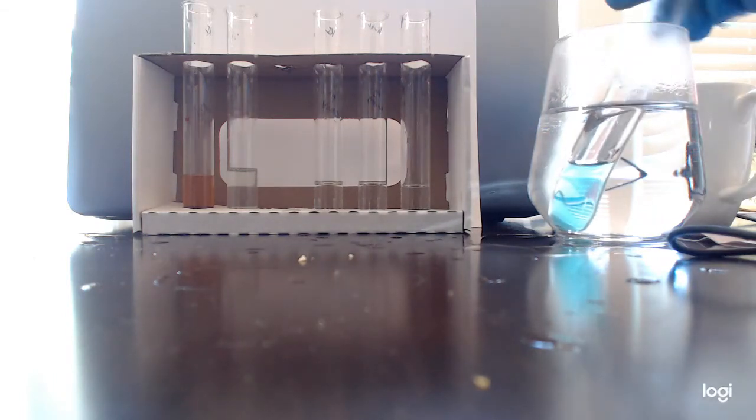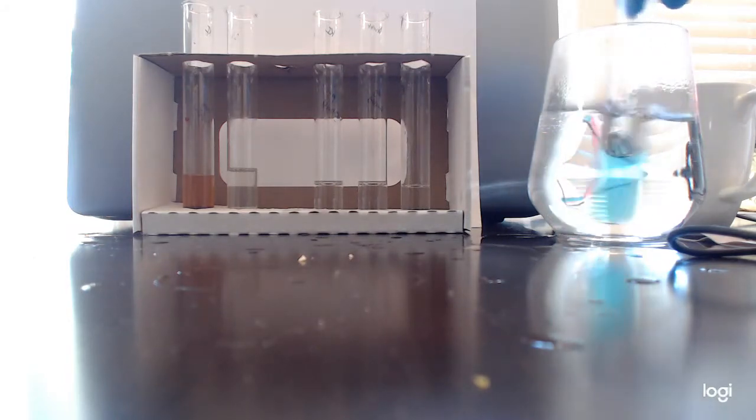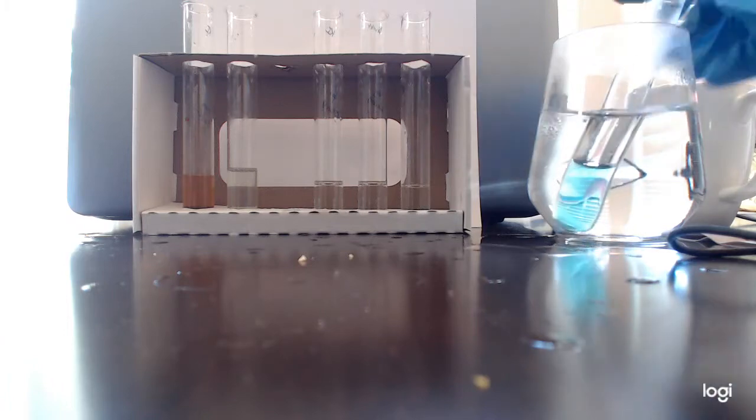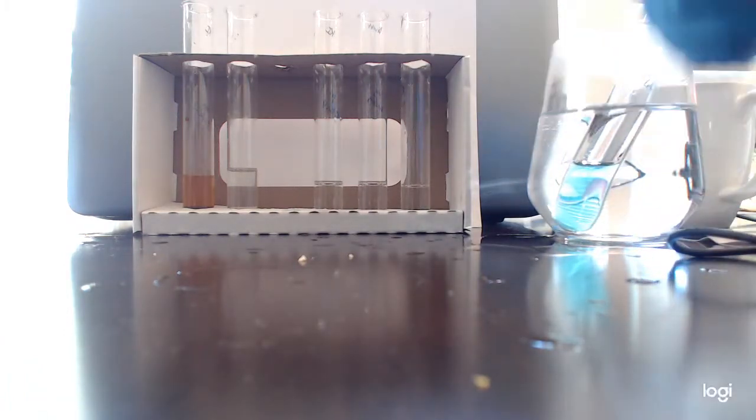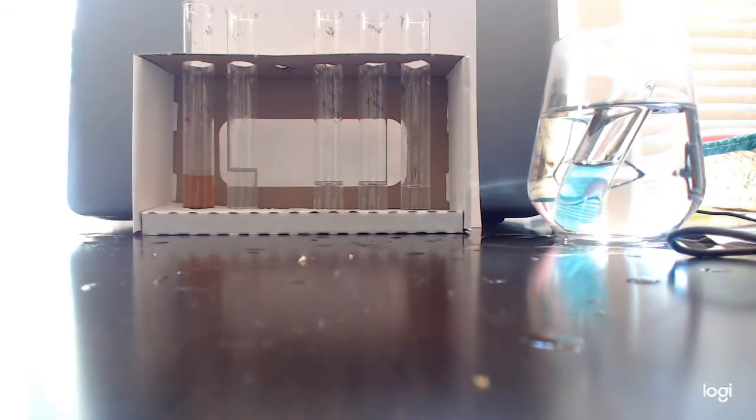And now I'm going to go ahead and leave this test in for orange juice and sugar. Now remember, it needs to be in that hot water bath for a few minutes in order to undergo this chemical reaction. I also might need to put hotter water in there, so if you'll keep on watching that for me, I'll see if I can get some hotter water.